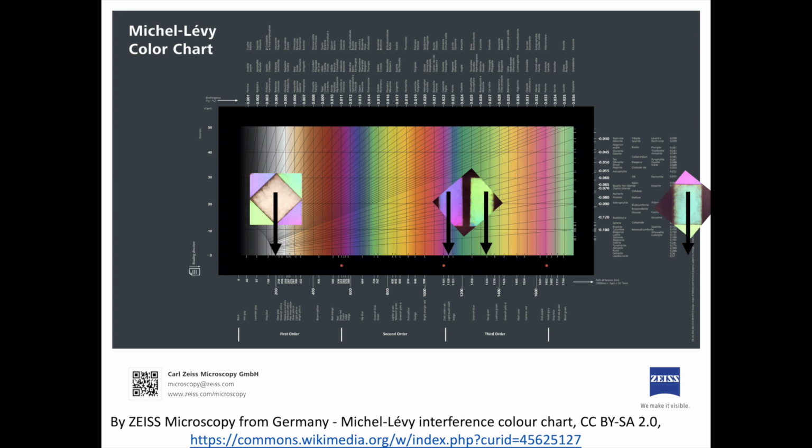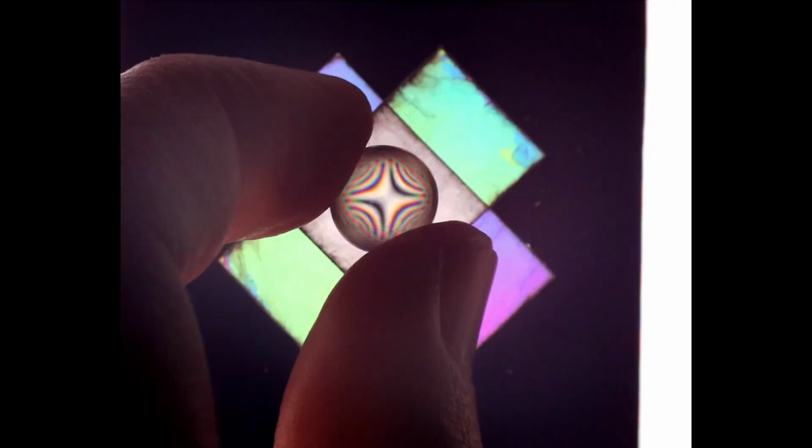Our interference figure for our plates that overlap parallel to one another is the same as the almost BXA interference figure we see for a thicker piece of muscovite. However, the interference figure for where we have our oriented muscovite sheets perpendicular to one another is much more complicated. So complicated, I'm going to leave that one alone.